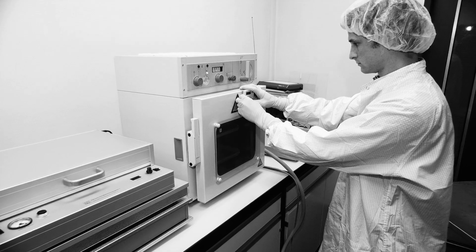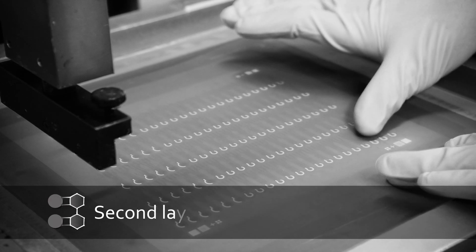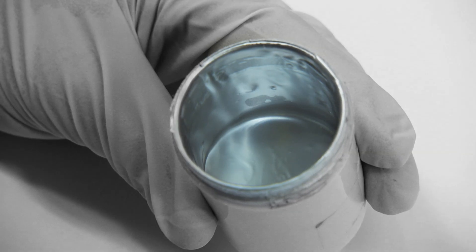A different material may be printed with the second layer to engineer reference electrodes made, for example, with silver chloride paste. The layers are aligned using a high-precision camera.